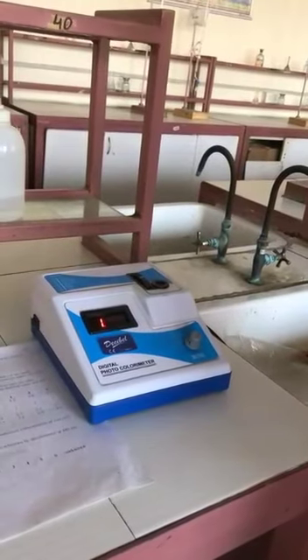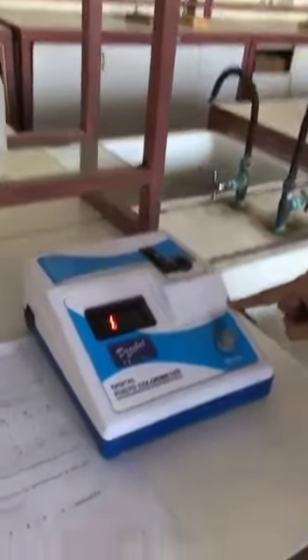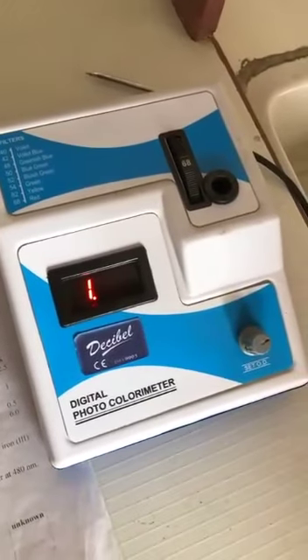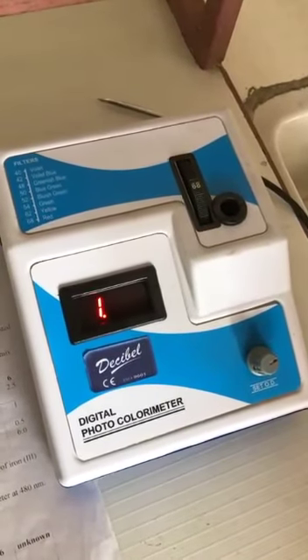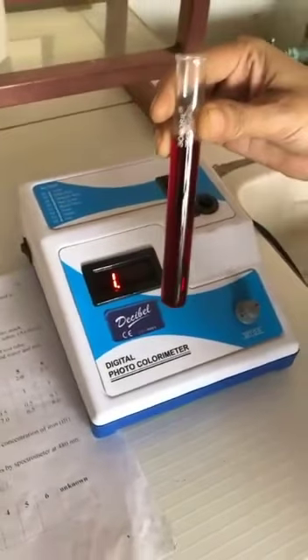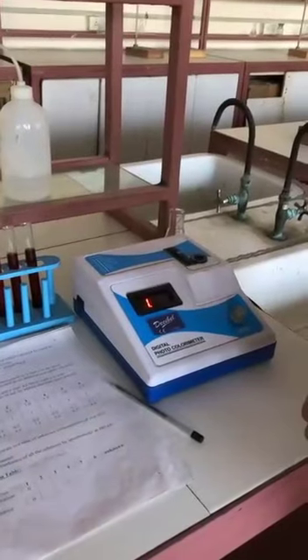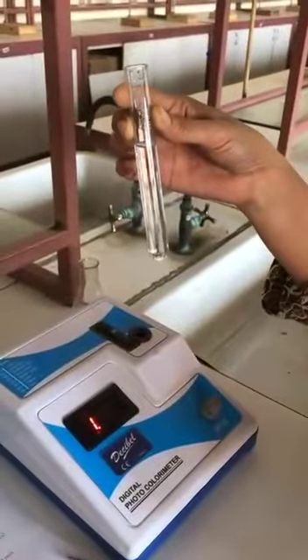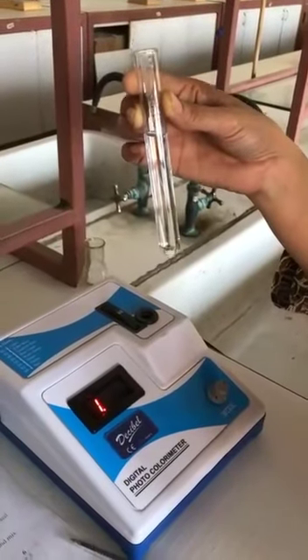We are going to find out the absorbance of all 6 test tubes with the help of a colorimeter. This is the colorimeter. In this, first of all, we have to select the filter. The filter is selected on the basis of the color. As in the given test tube, the color is red, so we have to select the complementary color. First of all, we have to calibrate the colorimeter with the help of this test tube, because in this test tube there is no color because there is no iron sample.